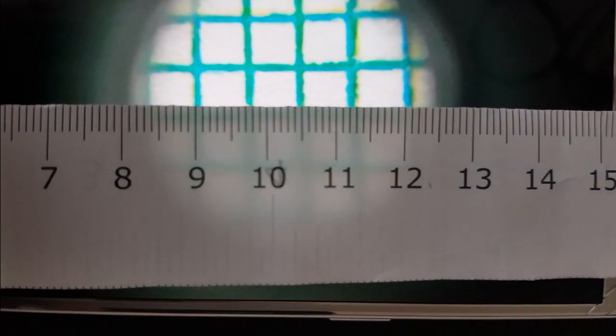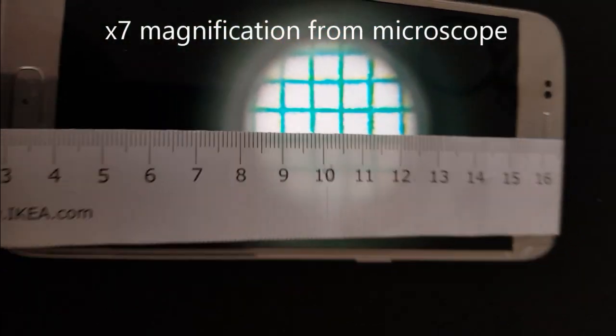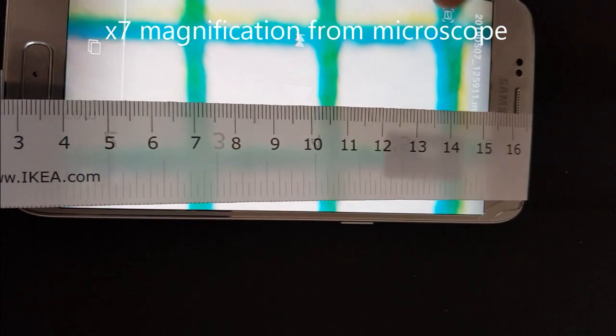This is millimeter graph paper. On my phone unmagnified, the one-millimeter squares now appear about seven millimeters wide — so that's a times seven magnification, not times 60. I mean, I suppose I could zoom in, but I'm not sure why I'd need a magnifying glass then.